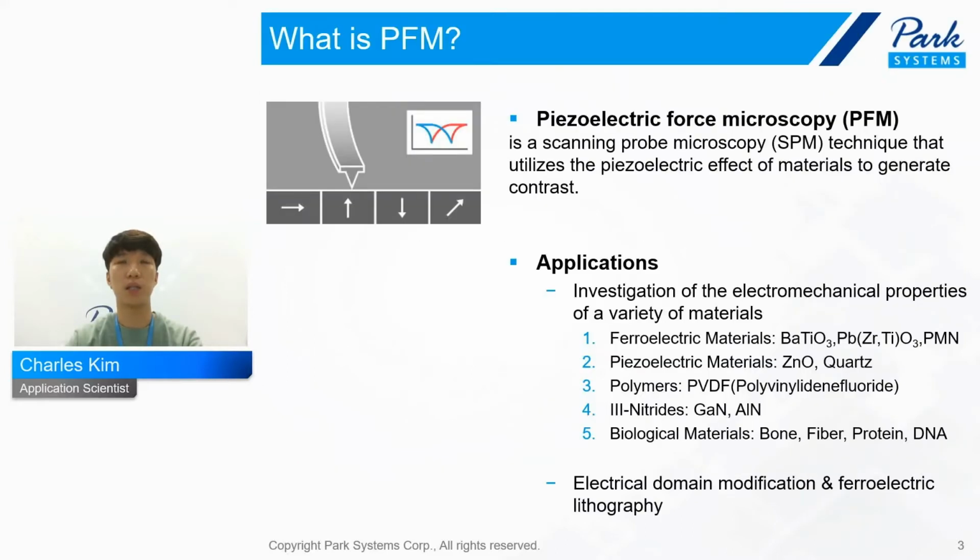So here, what is PFM? PFM is piezoelectric force microscopy. This is a scanning probe microscopy technique, and it can utilize the piezoelectric effect of the material, and you can generate contrast and map that contrast over the whole surface.